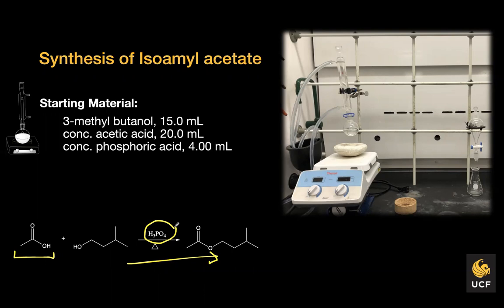And phosphoric acid was used as a catalyst; it speeds up the reaction by lowering the energy of activation, but oftentimes the reaction would take place using a different mechanism. This specific reaction was heated up to form the product. We put all the starting material in a round bottom flask with a stir bar, and then we heated the reaction mixture under reflux. So that was the first time we encountered refluxing a reaction mixture.